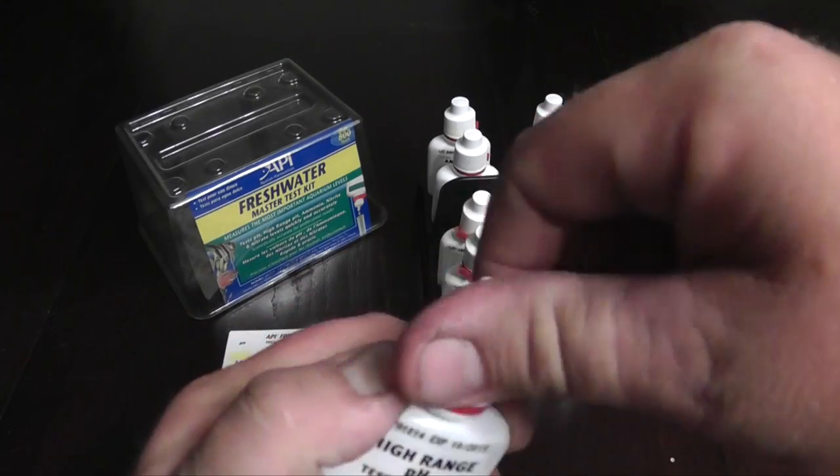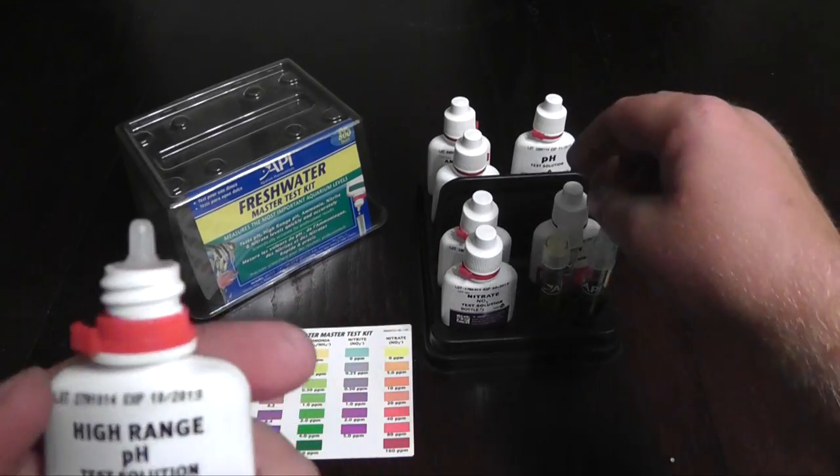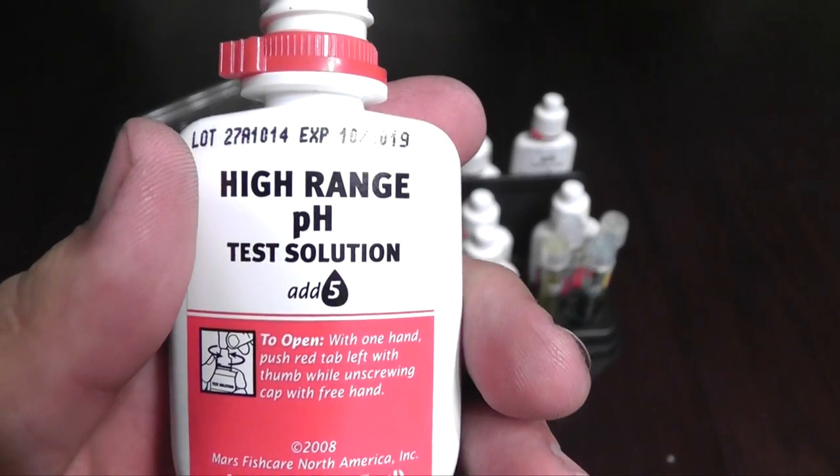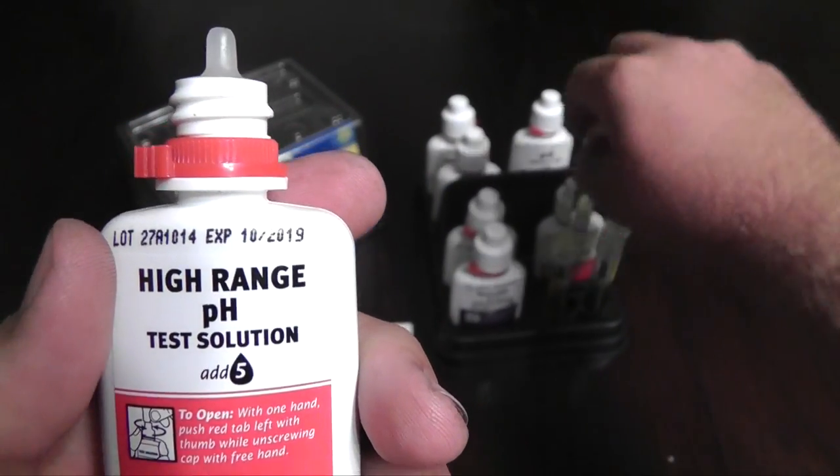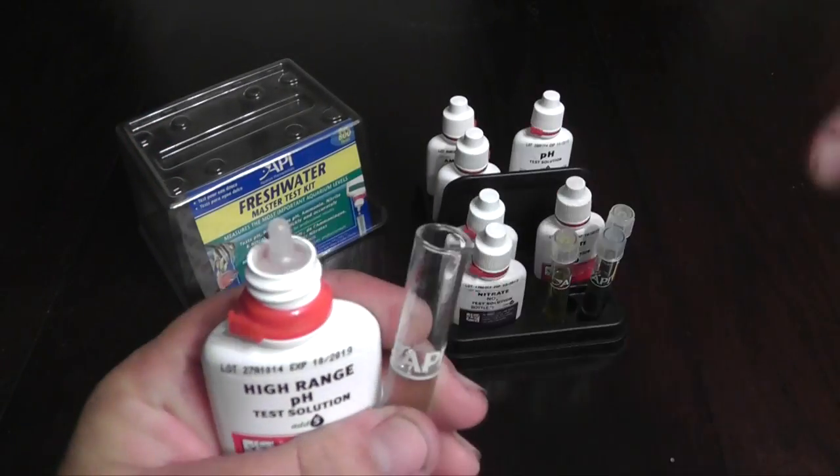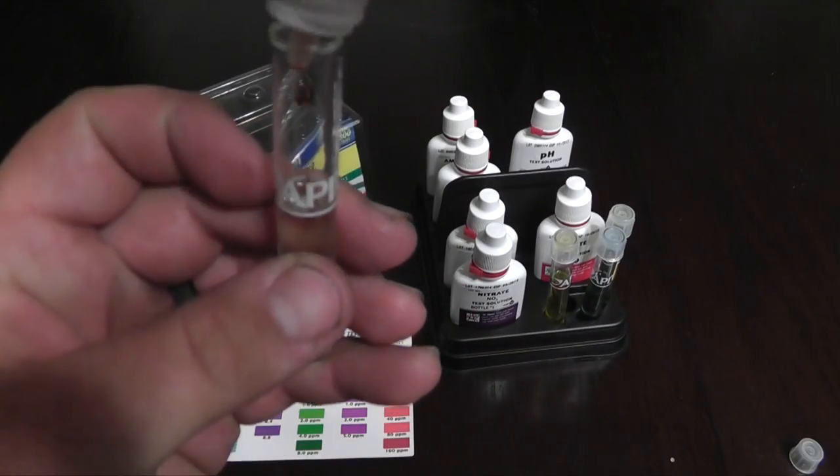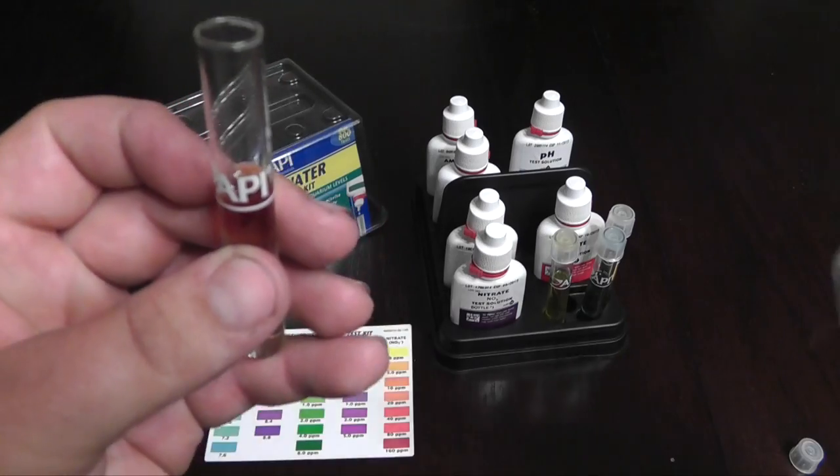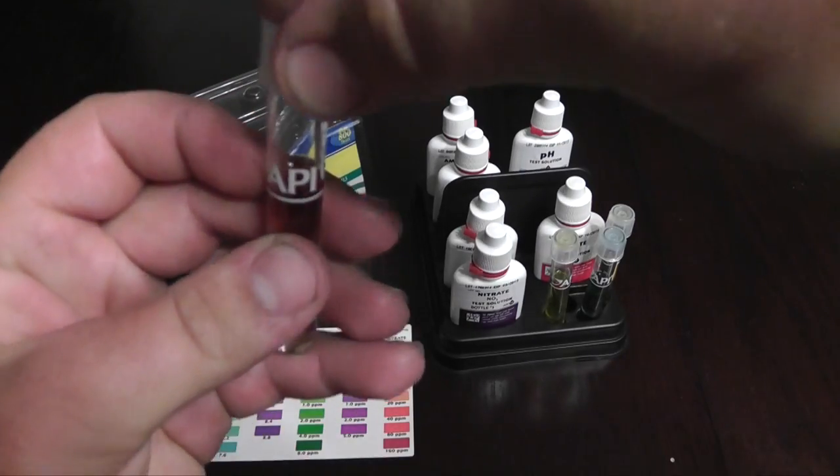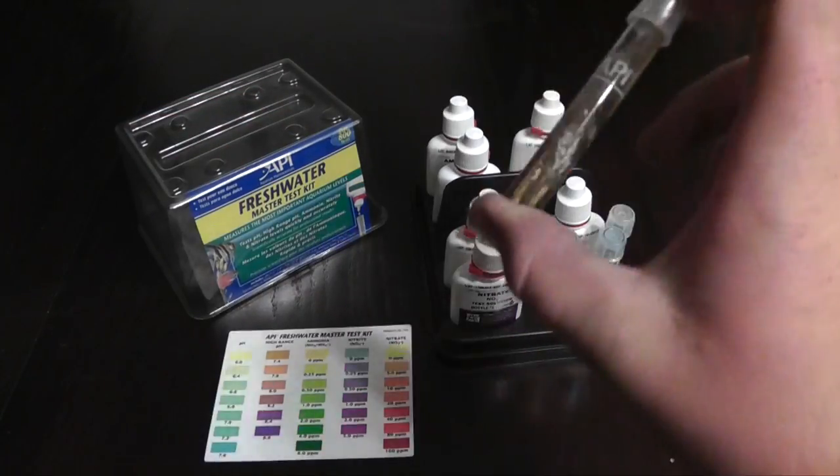Now we're going to test the high range pH using five drops. You can see right here on the camera. So we're going to open up the test tube. We're going to drop in five drops. And that is done. I cap that and shake it up.